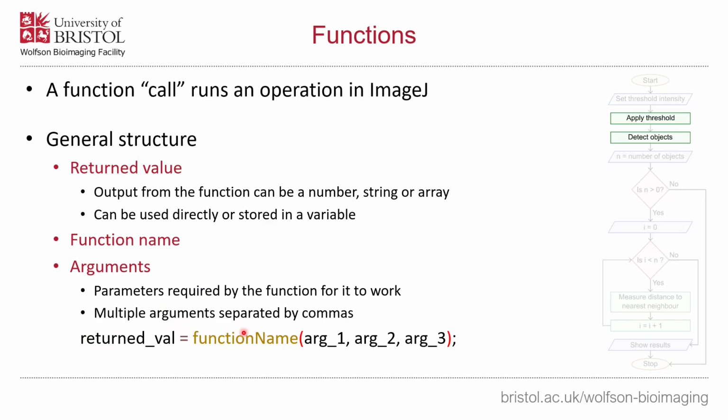So this one again follows some rules, similar sort of rules to the variable names. So don't start with a number, don't have any funny characters in there like percentage signs or slashes, and don't have any white space. Slightly different here is that the general convention is that you use something called camel case, or in this case lower camel case, where you capitalize the first letter of each word, except for the first one, which you do in lowercase, hence the lower camel case.